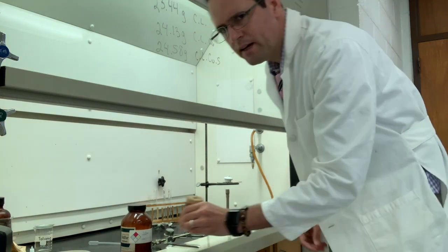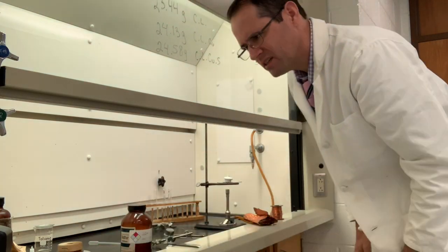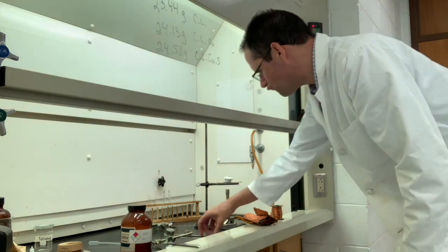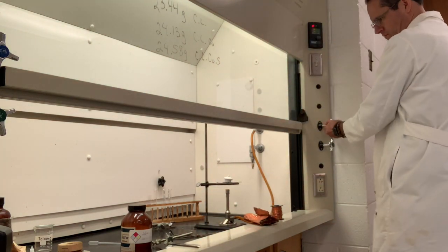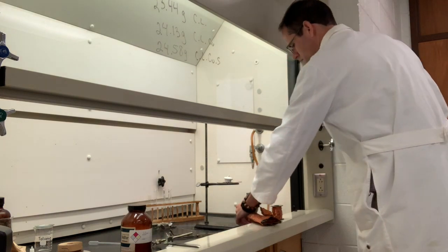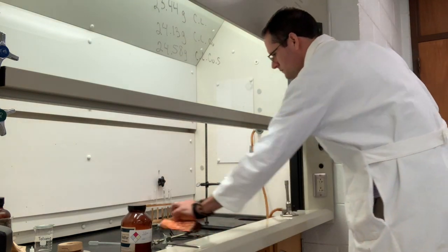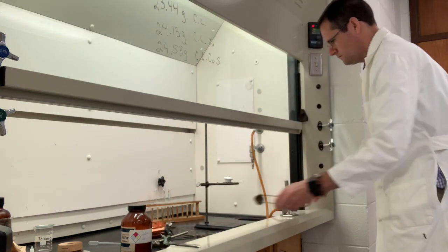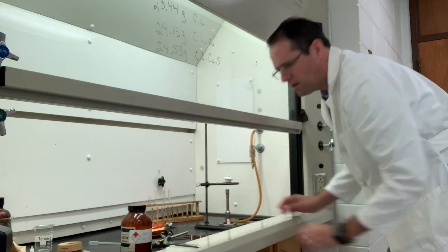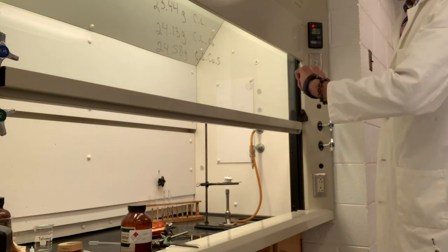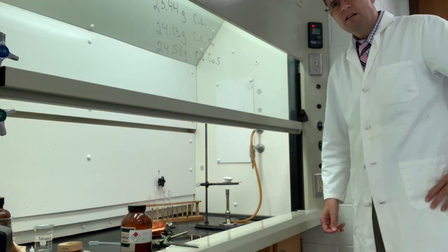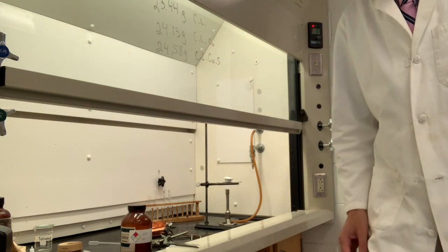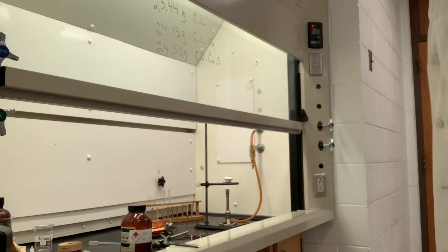When the fume hood runs, it'll be quite loud, so I won't be talking during the video. All right, let's fire up the fume hood. And I'm supposed to raise the lid every five minutes, just to make sure there's no more sulfur, and then the reaction will be over. I'll show you what it looks like when it's burning.